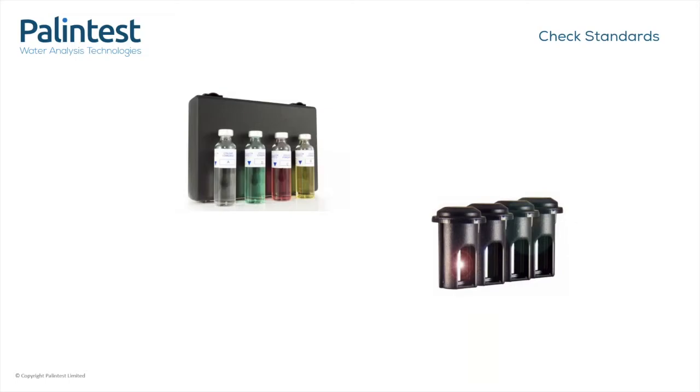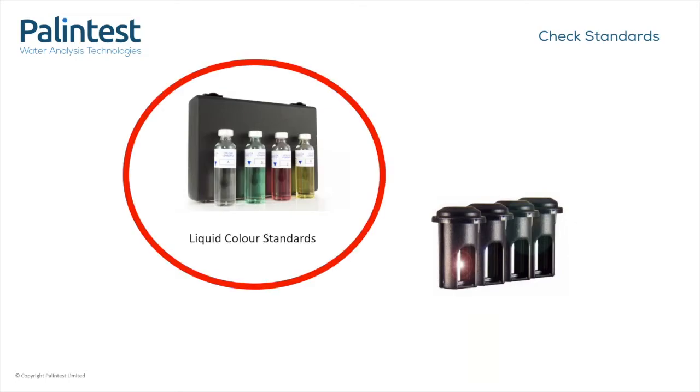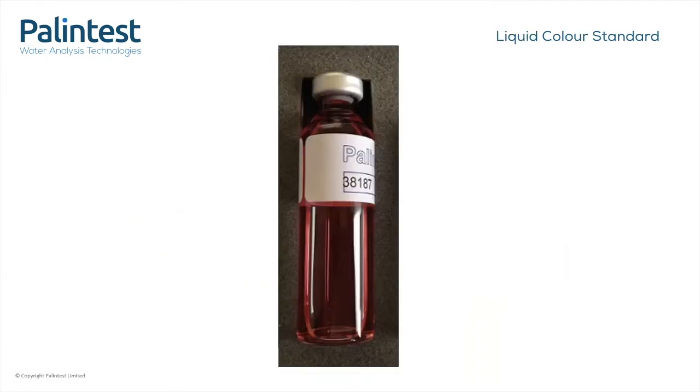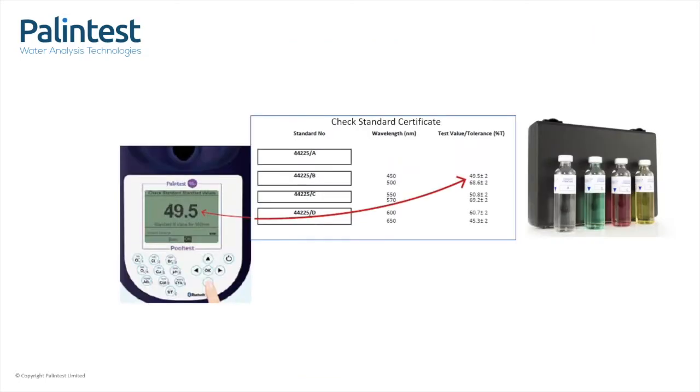Now, we supply two types of check standard. And first, I'm going to talk about liquid colour standards. These are small sealed vials of coloured liquid. The liquid has been formulated so that for any particular wavelength of light, it has a known percentage transmission value, referred to as the percent T.